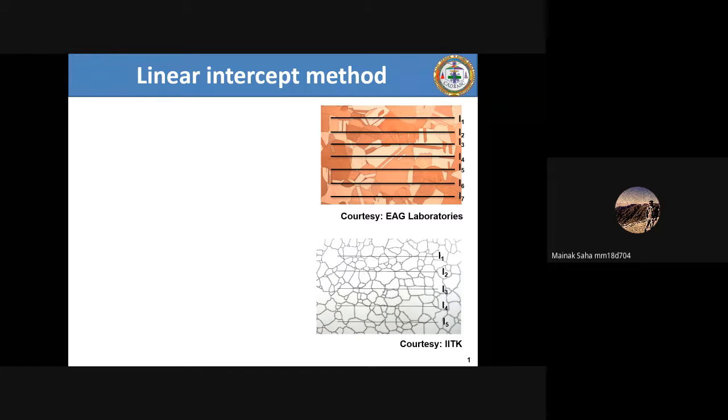Okay, now I think you have the idea. So tell me, has Sir taught you about the grain size then? Yes, sir. We discussed some methods, like the linear intercept method. We discussed how we determine grain size, firstly we saw what the microstructures actually look like, and what scale we are dealing with. And we saw that we have certain methods to measure grain size.